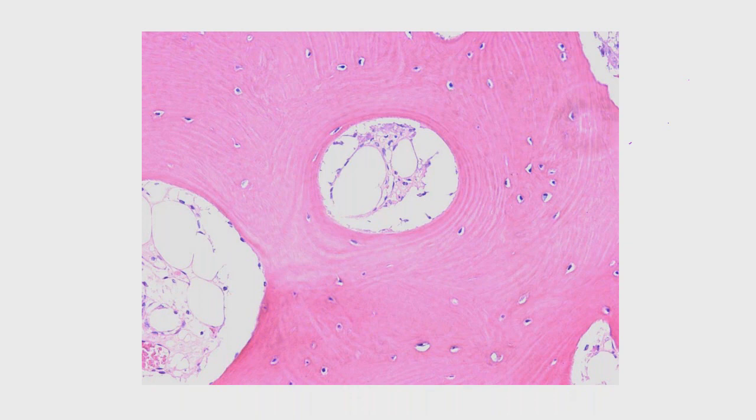Not only can you see the osteocytes, and not only can you see the vascular canal, but this preparation was done very well because you can see the delicate layers of bone that have been laid down around this haversian canal in the center. These circles going around it, this is how bone continually grows and develops. It just continues to put layer on top of layer on top of layer. And I gave you the analogy before of a tree, the concentric rings in a tree.